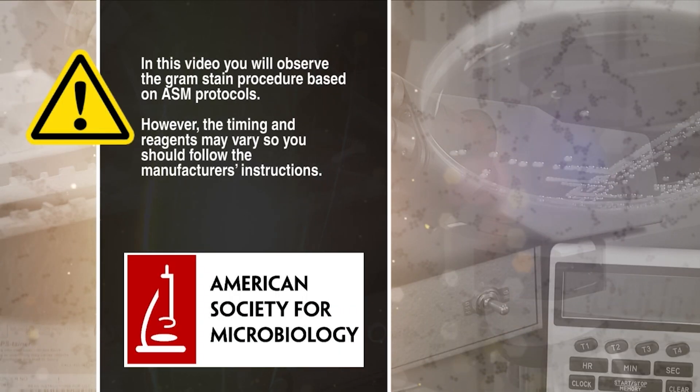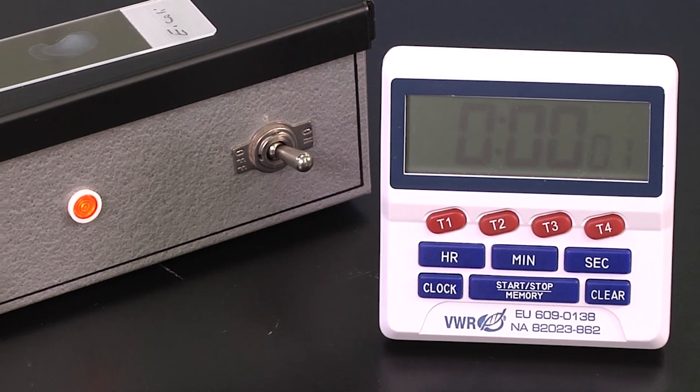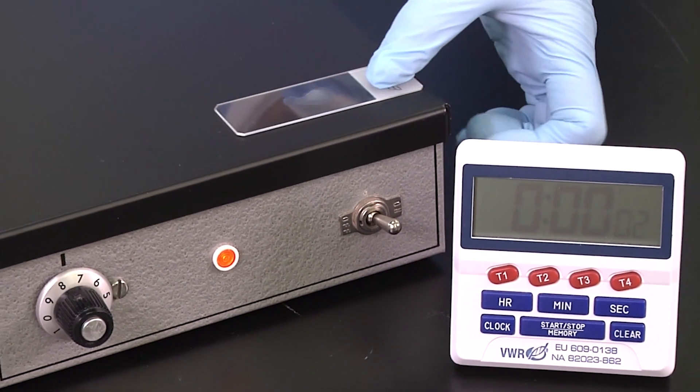In this video, you will observe the gram stain procedure based on ASM protocols. However, the timing and reagents may vary, so you should follow the manufacturer's instructions. This is the typical setup for the gram stain seen in most clinical and public health laboratories. The gram stain reagents are placed beside the sink, and a slide rack is placed over the sink to hold the slide. A rubber hose may be attached to the faucet for ease of rinsing the slides. The procedure starts with a thin, fixed smear on a glass microscope slide.